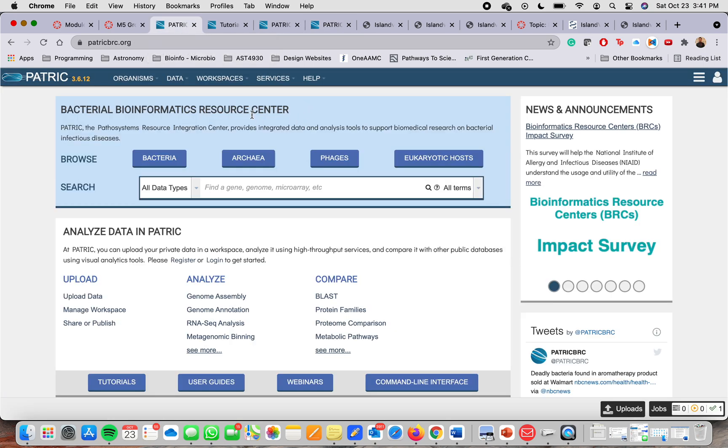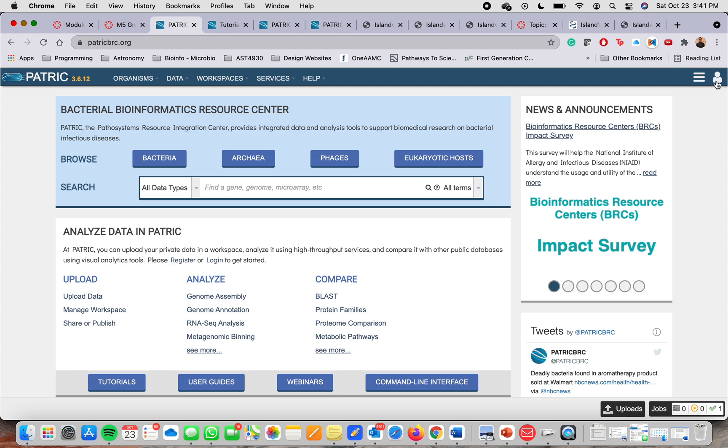And once you have your account, you have to log in here. You're going to log in. As you see, I'm signing as Julman B. My first name, Julman, my last name, Bottino.